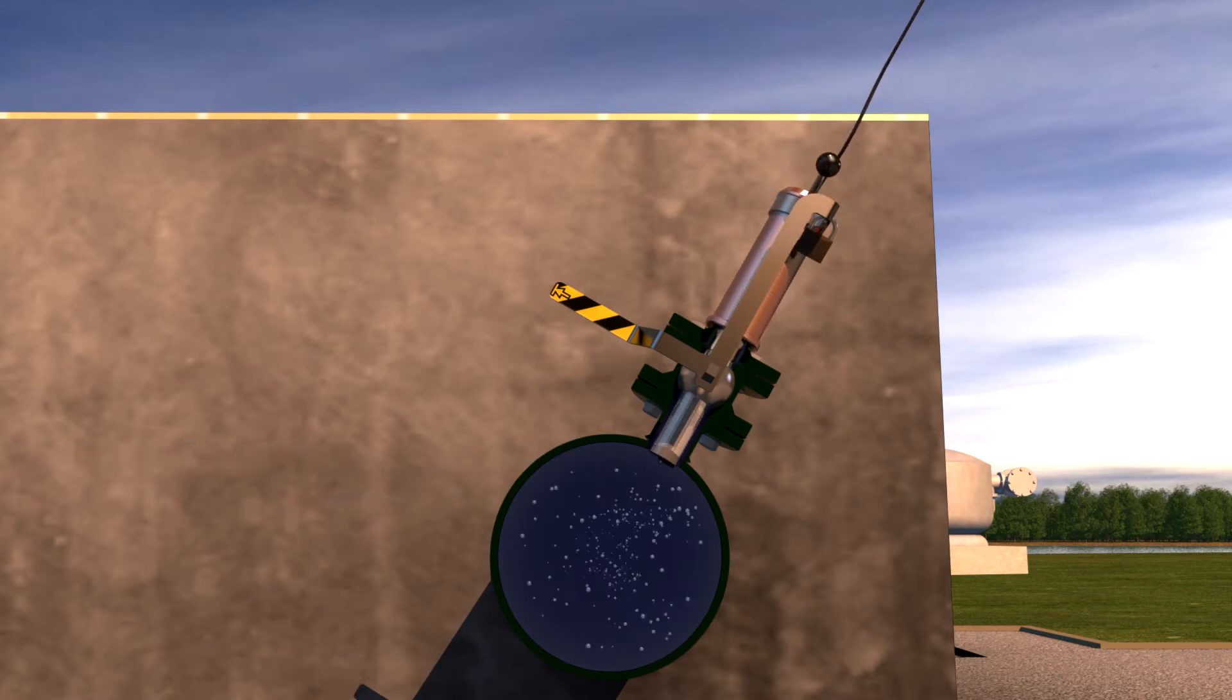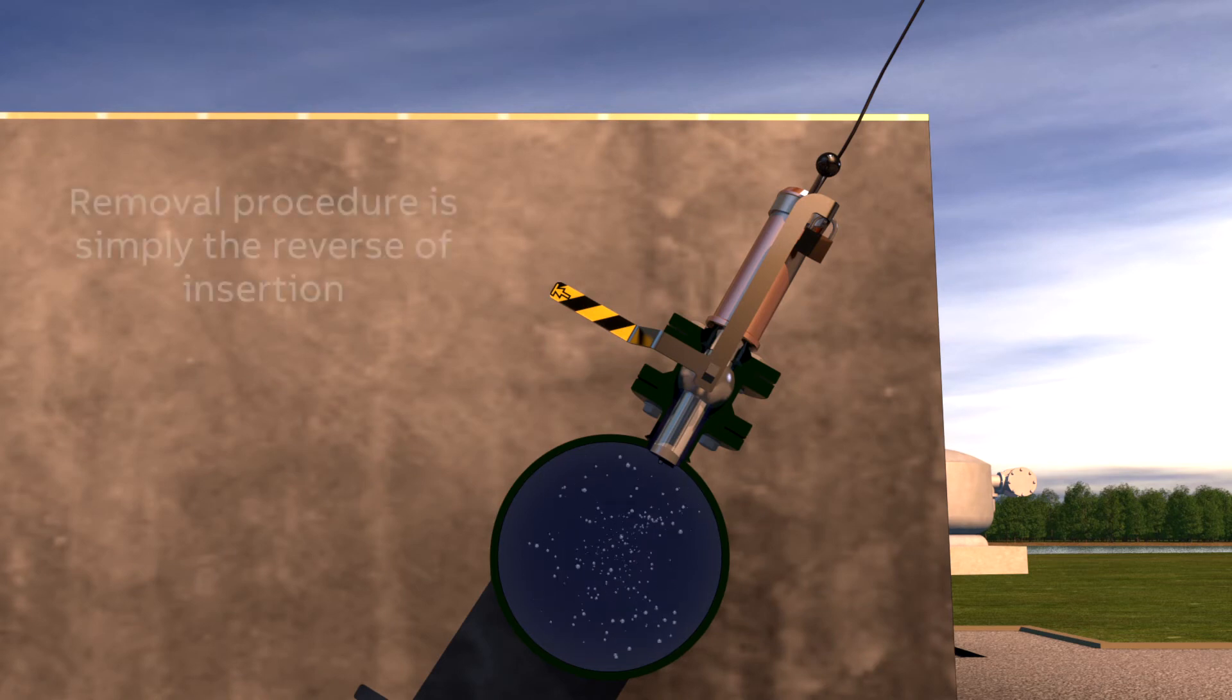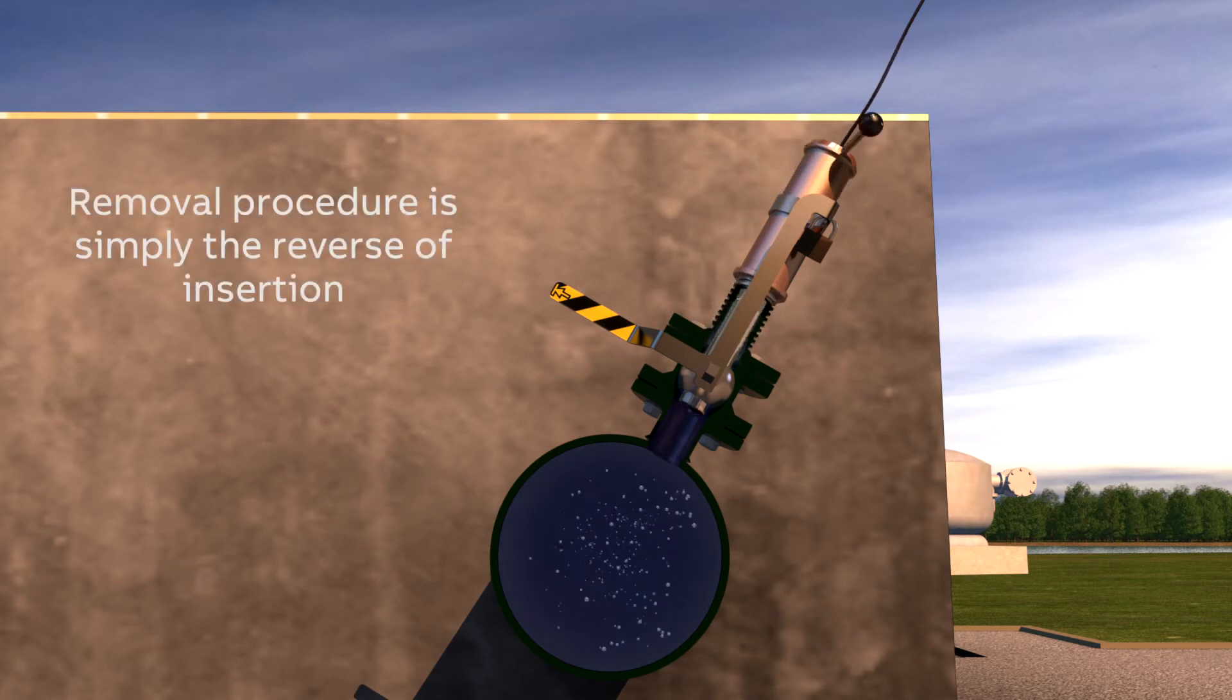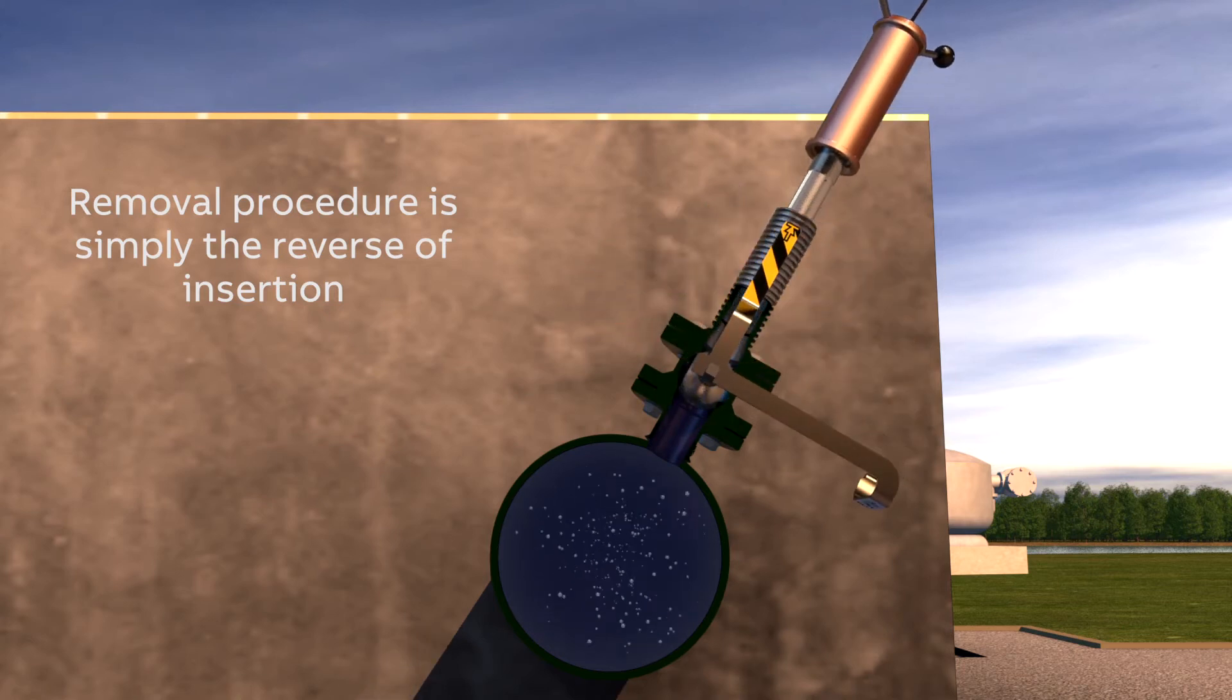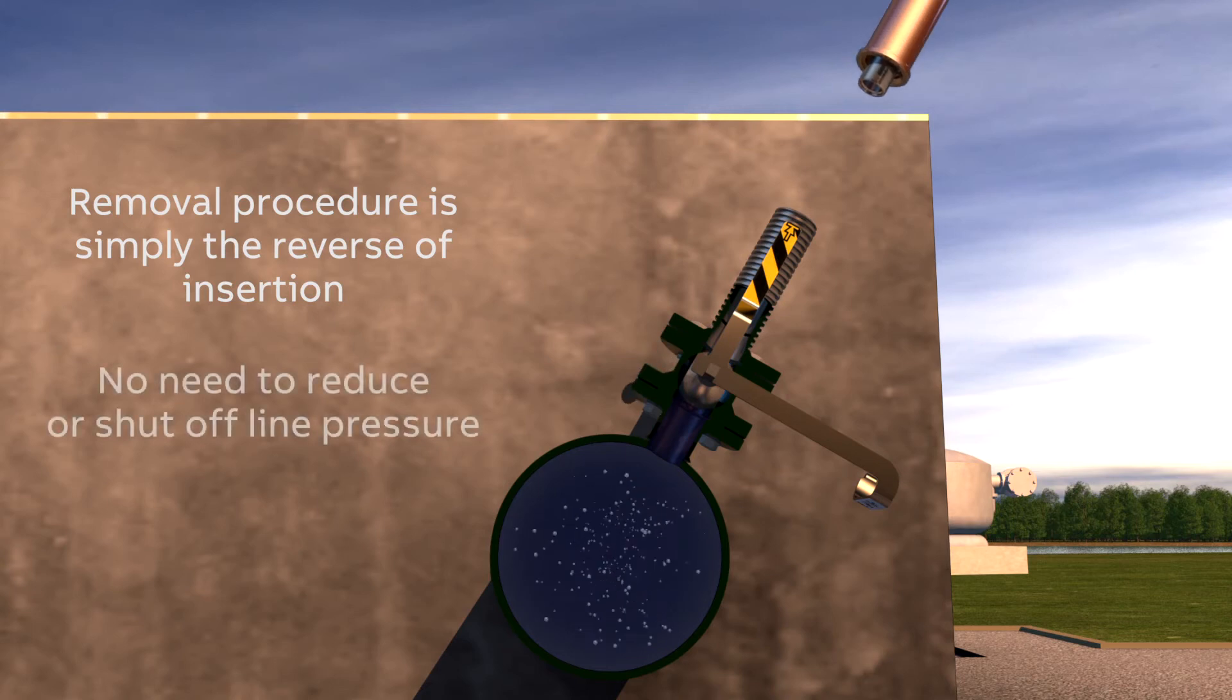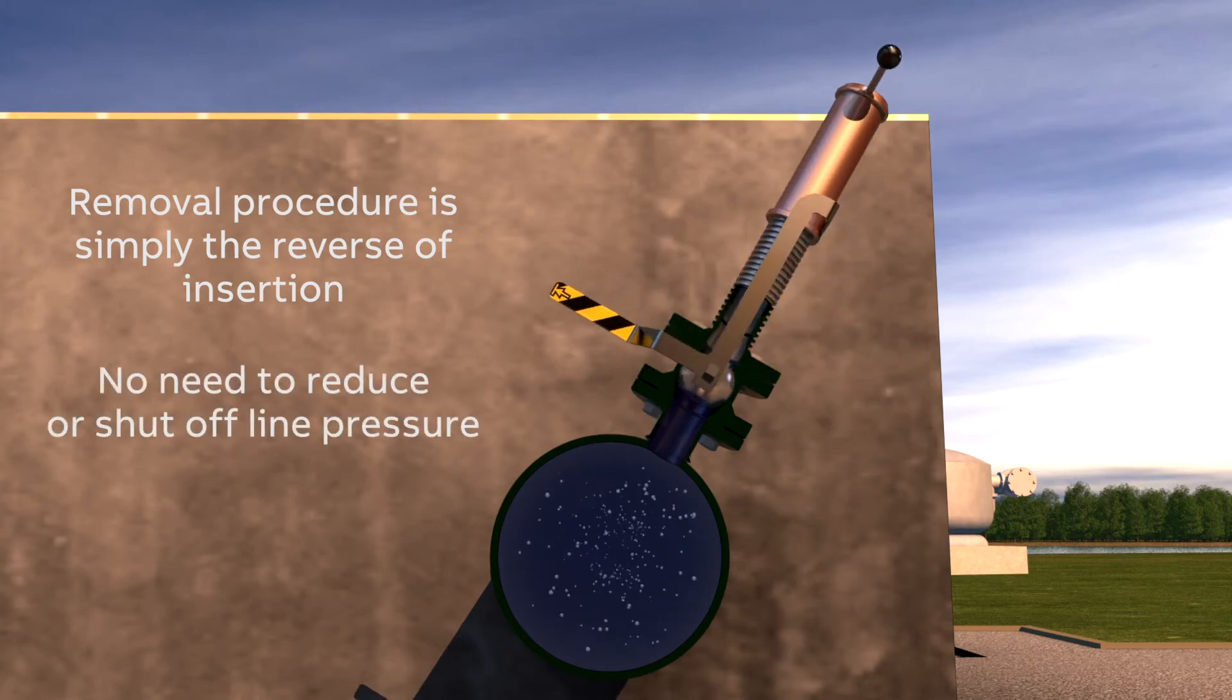Removing the sensor from the line is equally straightforward. By turning the capstan handle in the opposite direction and closing the ball valve, the sensor can be withdrawn even while the line is under pressure, with no need to reduce or shut off the line pressure.